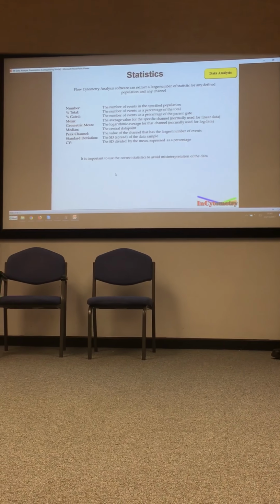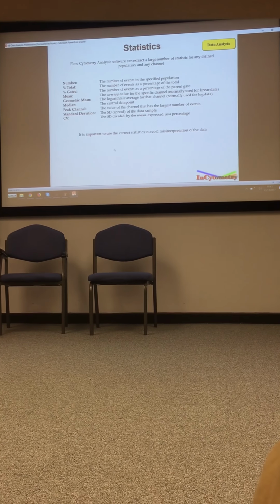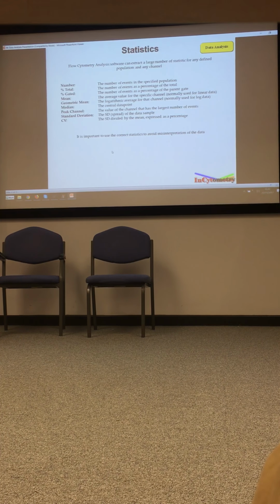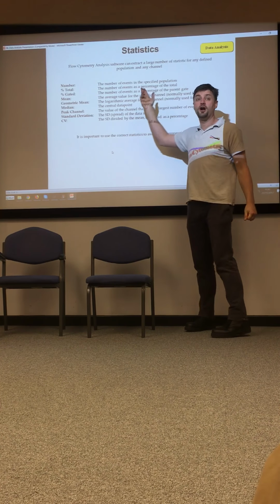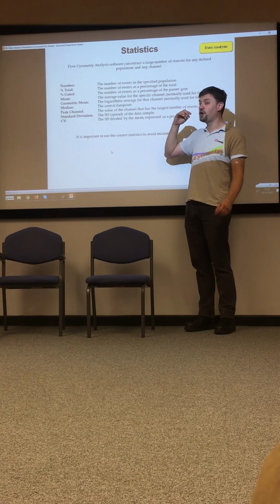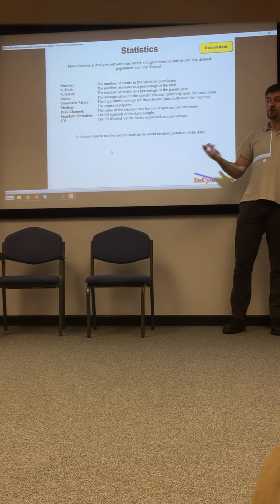If last week I ran 10,000 and this week I ran 100,000, no, not really. I've done worse. So I go away and analyse it and come back to you and say, right, well, my T cells last week were 4% and this week they're 6%. Have I done well? Come on, you must know this by now. Yeah, depends. If I've got a lot more debris last week and no debris this week, no. Because if I've got, of that 100,000, if 80,000 is debris, no, that's terrible.